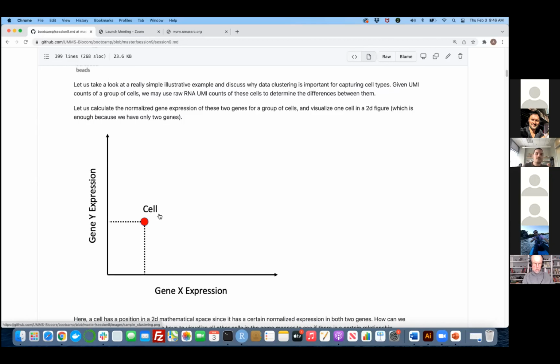This by itself doesn't tell you much, right? So we need a lot of other cells in order to understand what's happening to the cellular population. The beauty of single cell analysis is that now we have a lot of barcodes and a lot of cells, some number of thousands of them, right? Of course, if your library is bad, or your sample is not properly collected, you may have a terrible number of cells with a high number of UMIs. But normally, if everything goes well, you will have quite a high number of cells, so that you can see what's happening to each gene in totality.